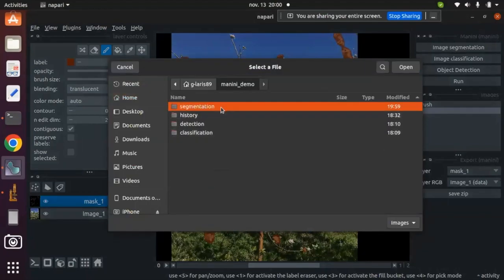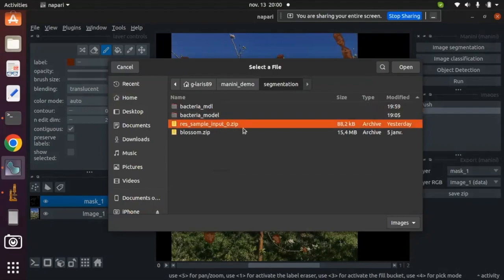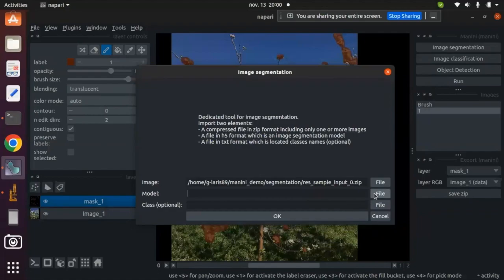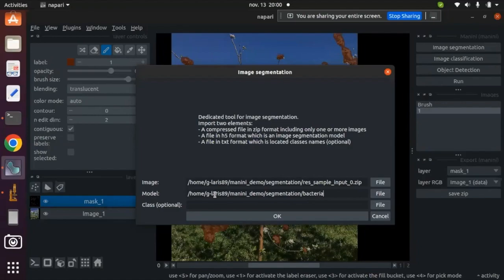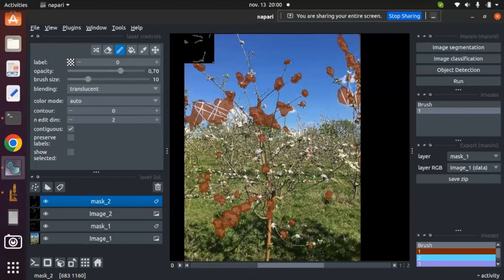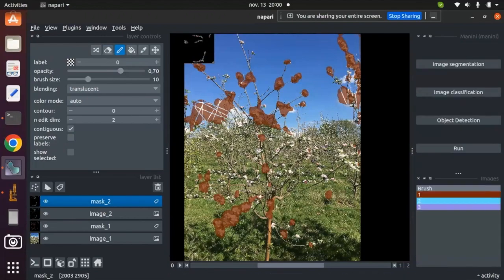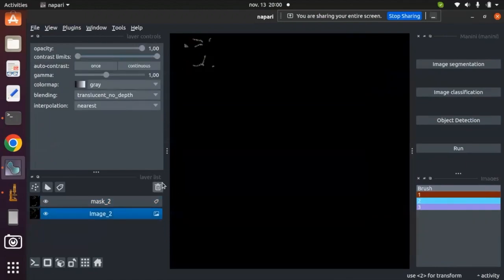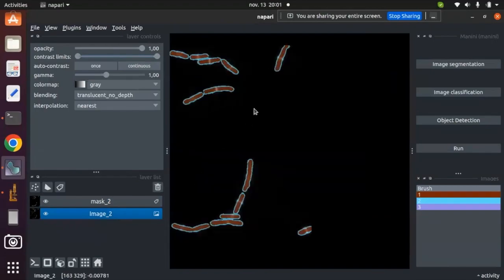Now I can use it in the Manini plugin. I go to segmentation and import the images. For the model, I need to specify it — it is a folder. I import it by entering the path. I click OK and run the image segmentation. The result is here. I remove the previous segmentation, and here is the result of the segmentation of bacteria.